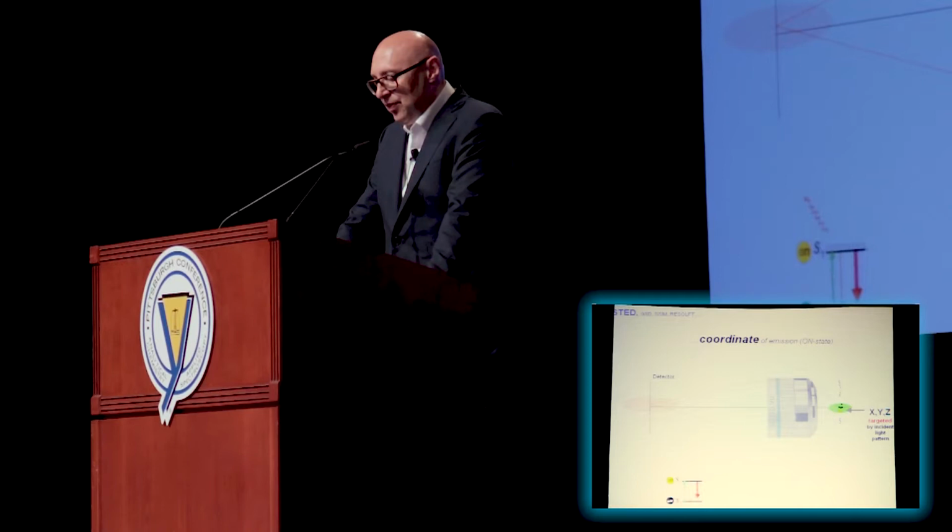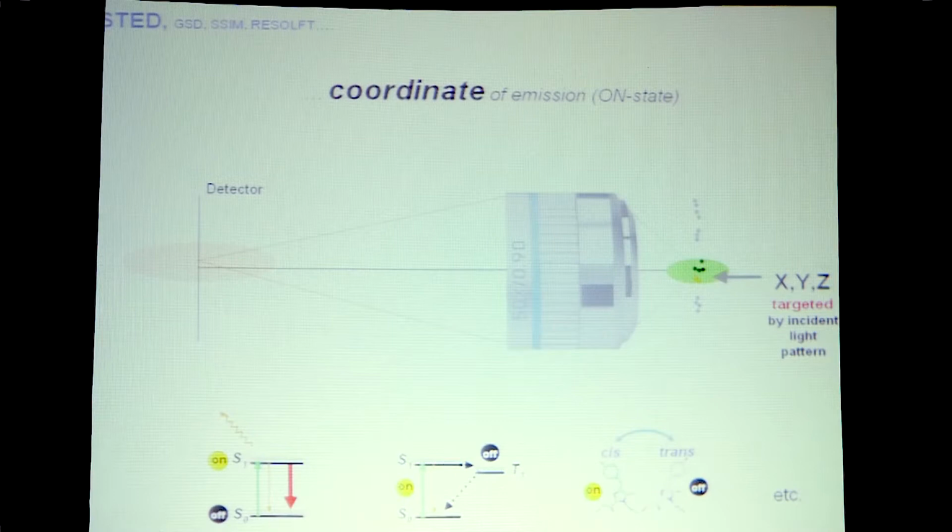Now, STED uses the most fundamental way of turning a fluorophore off, that is stimulated emission. So if you want to turn off any fluorophore by physical means, the most general way of doing it is stimulated emission. But of course, there are also other dark states that you can use in order to transiently turn a molecule off. And they have been described in the literature.